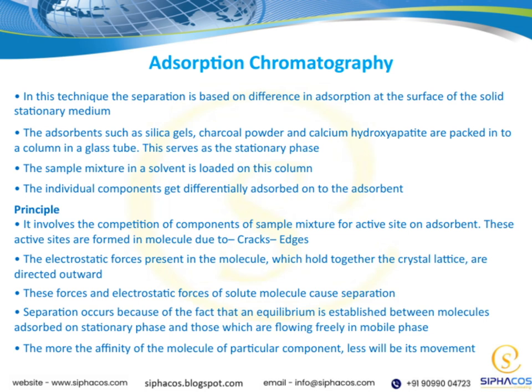It involves a competition between the components of the sample for active sites on the adsorbent surface. These active sites are typically formed at the molecule's cracks and edges, which are more reactive spots. The electrostatic forces within the molecules, which help hold the crystal lattice together, also play a role. They tend to extend outward and influence how molecules interact with the adsorbent. The separation occurs because of a dynamic equilibrium.